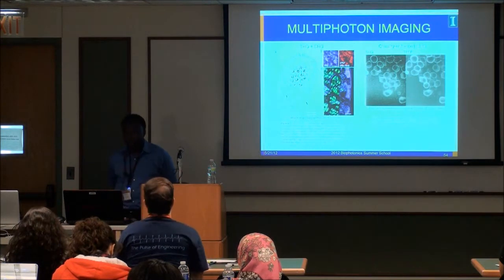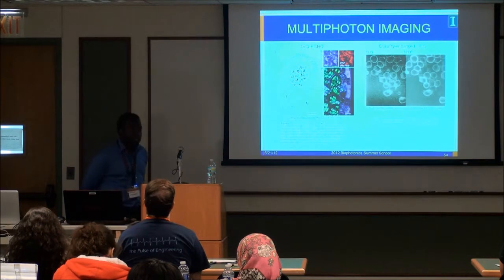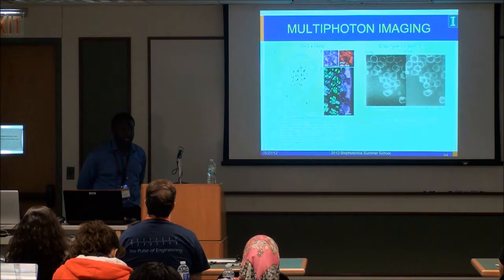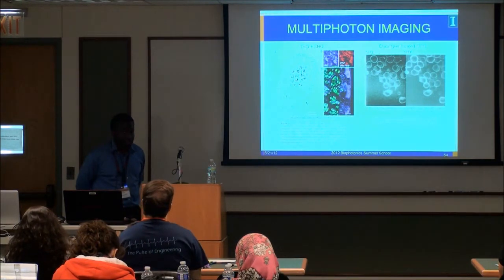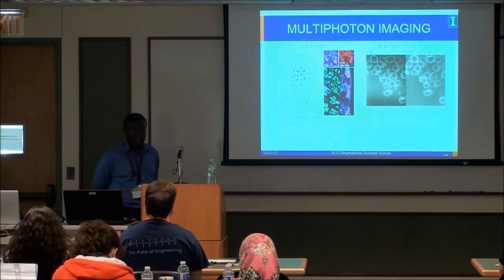If you use an external agent, then you could actually. Oh, yeah, exactly. And actually, ironically enough, SHG was observed first, before the two photon fluorescence. And typically, the popularity in SHG has gained a little bit more momentum. Campagnola has done a lot of work earlier, especially, but it has gained a bit more momentum because of the multimodal techniques. It's an additional color signal that you get. But a lot of the workhorse for this stuff has been carried out in Taiwan and in Europe, particularly in France.